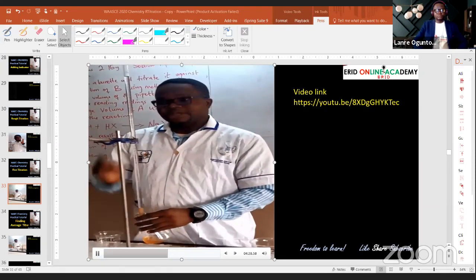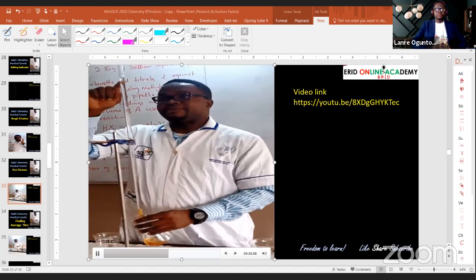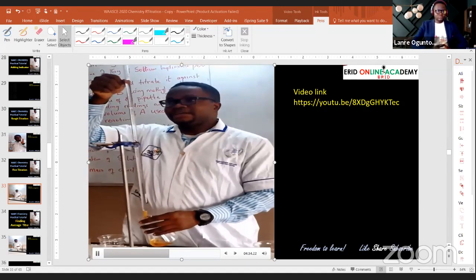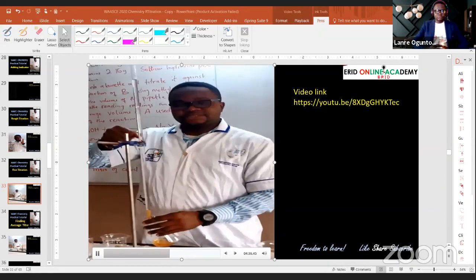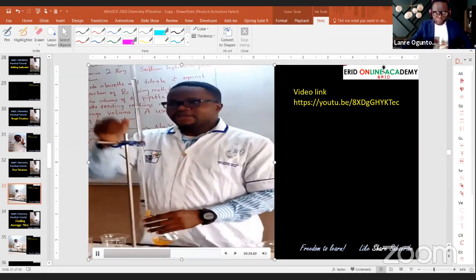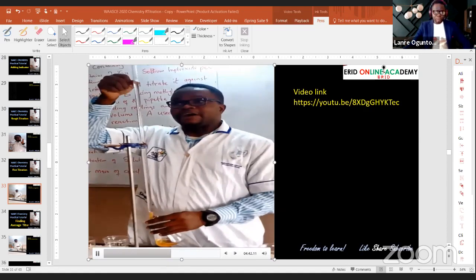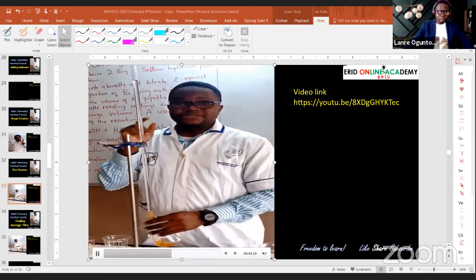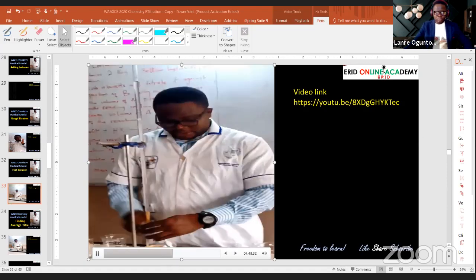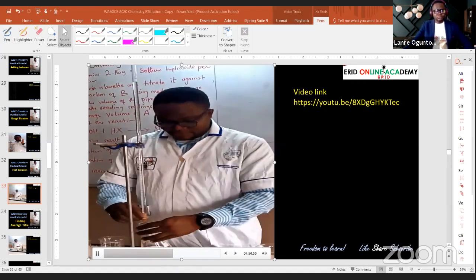You now focus on this because you are concerned about the accuracy. My rough titer was 26, therefore I can be very fast and run it from 0 to 20 to save time, because you need to work with time as you are working in your exam.